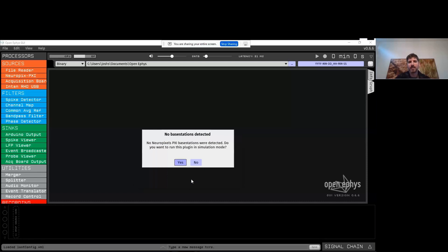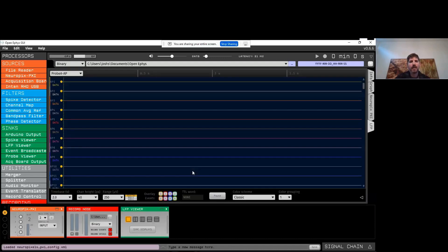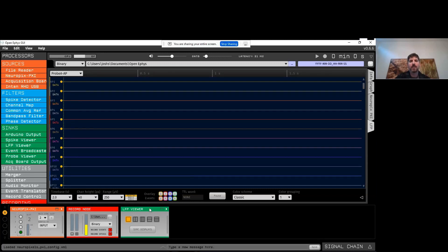We're going to hit Load. I don't actually have any Neuropixels hardware hooked up right now, so I'm going to run the plugin in simulation mode and select one Neuropixels 1.0 probe to connect. It then adds three plugins to the signal chain: one for receiving data from the Neuropixels PXI chassis, one for recording data, and one for visualizing data — the LFP viewer.